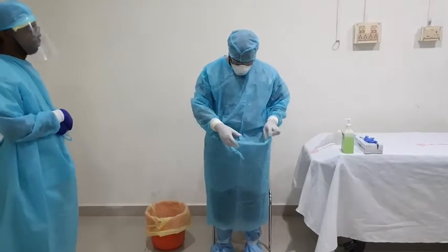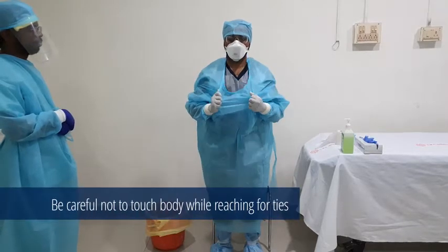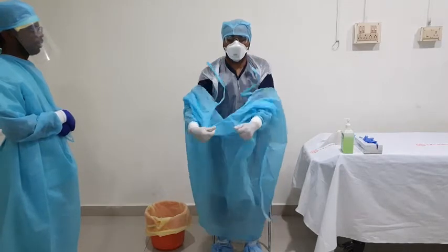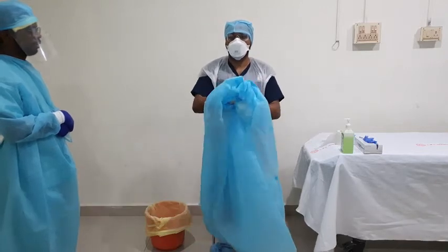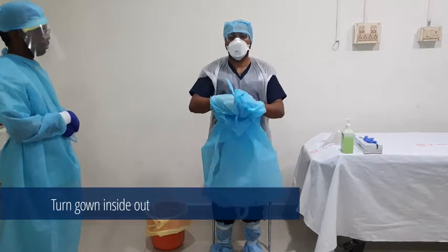Next, unfasten the gown ties, taking care that the sleeves do not come in contact with your body when reaching for the ties. Pull the gown away from the neck and the shoulders, touching the inside of the gown only. Make sure to turn the gown inside out, roll it into a bundle, and discard it into the infectious waste container.